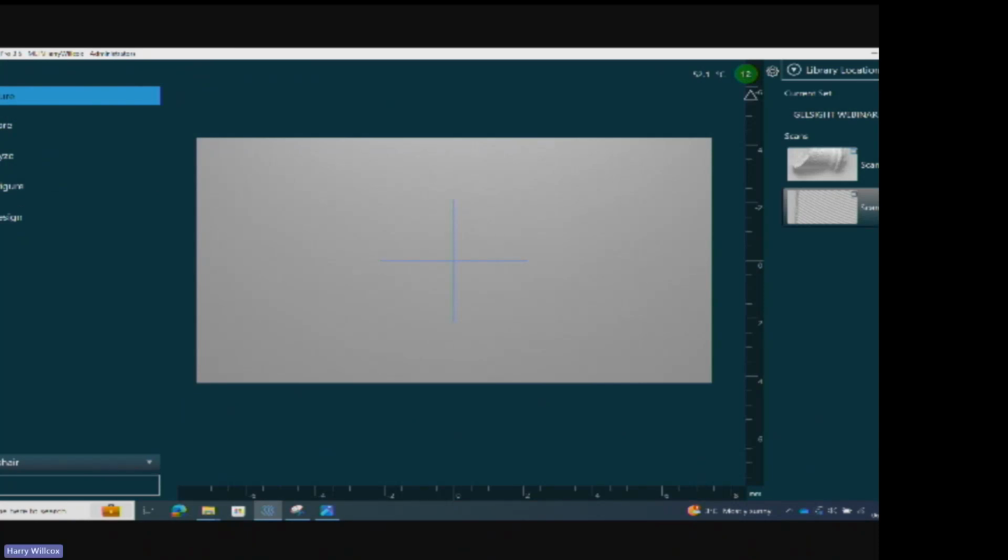Are you able to send an example STL file to me so I can look at the software and have a play with it? Yeah, that's fine, that's not a problem at all. If there's a specific sample type you'd like, whether that be a roughness standard, a radius, etc., let us know, and I can take the scan and send you the STL file. That's absolutely fine. I can also do it on the Gelsight Series 2 as well as the Max, so you can see the deviation or the changes within the resolution of the system.